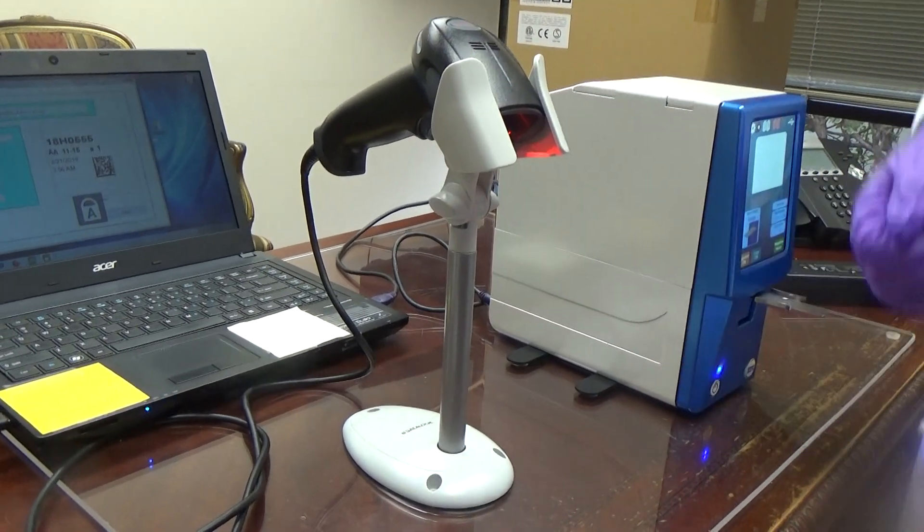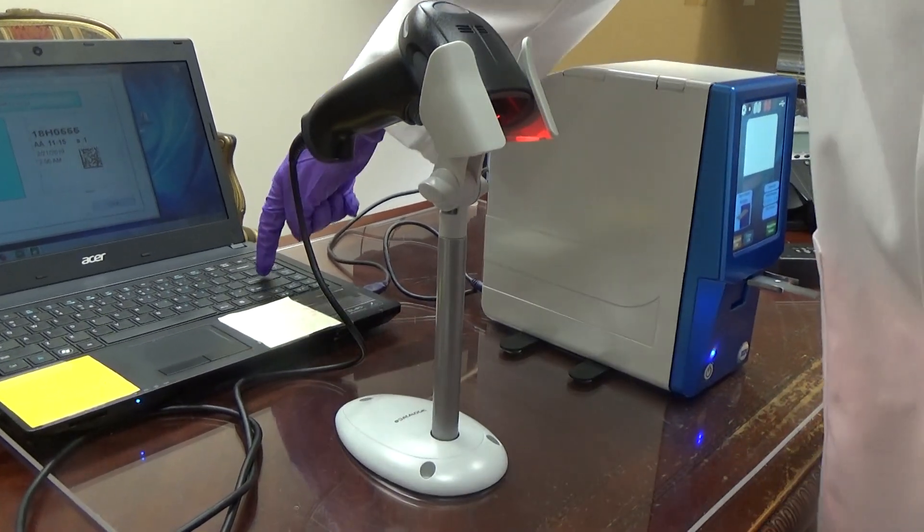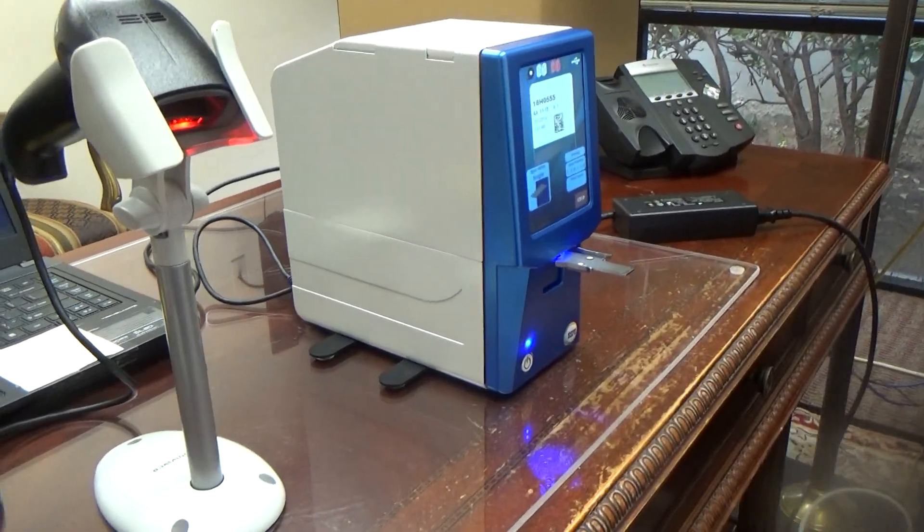Again, to explain the steps: you scan the cassette, press print, and the slide will print out within seconds.